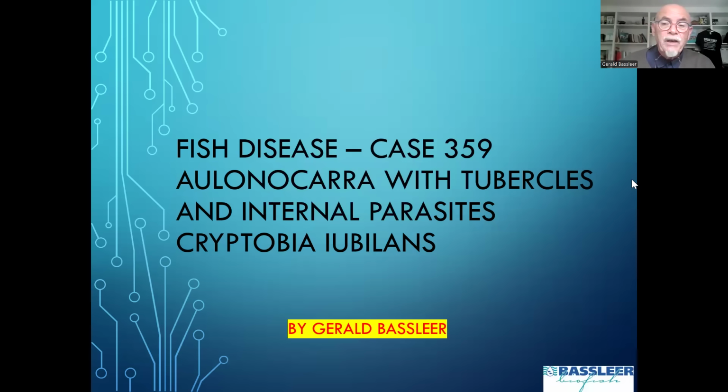And I show you my PowerPoint where I can share my findings, what diseases we found on this Aulonocara. In my case 359, we found tubercles in the organs and internal parasites, Cryptobia iubilans. Interesting parasite to observe. So I hope my microscopic findings teach you lessons on how to identify.